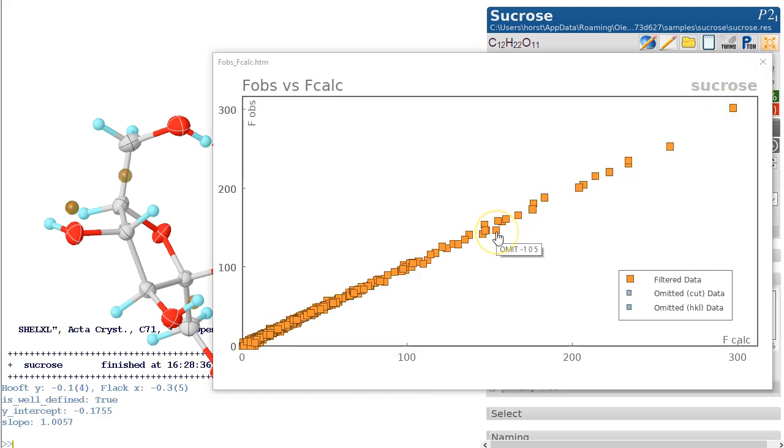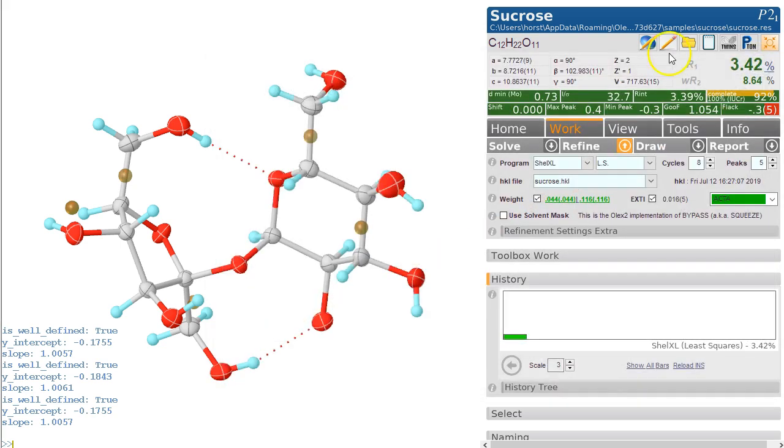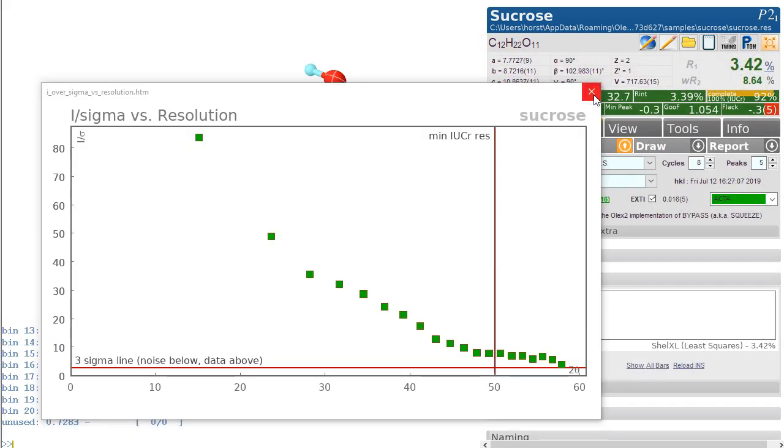You can omit a specific reflection by clicking on this on-off, whether you use it in the refinement or not. It's also worth having a quick check at the I versus sigma plot.